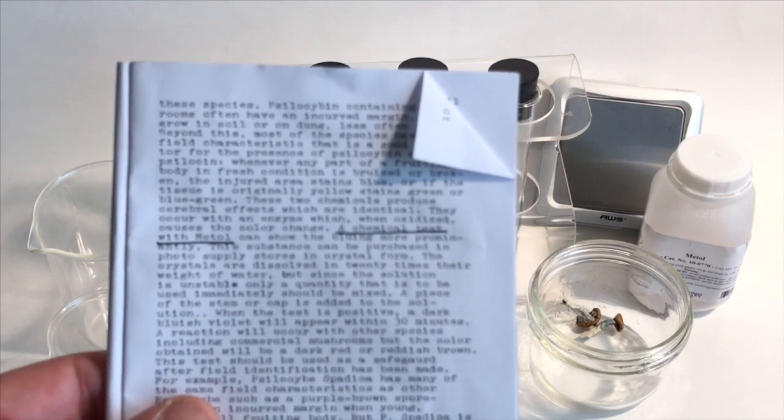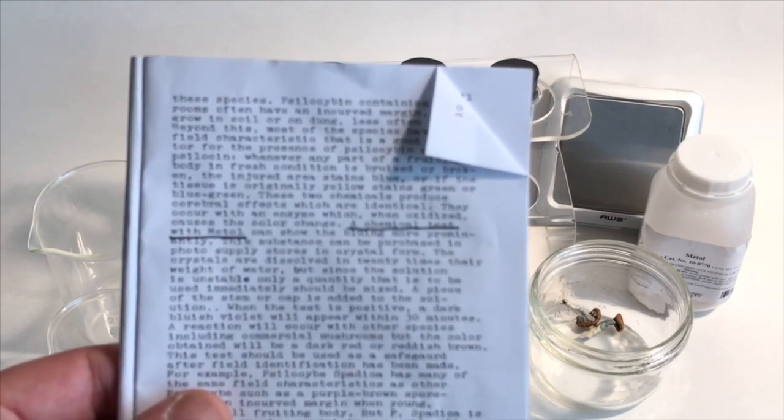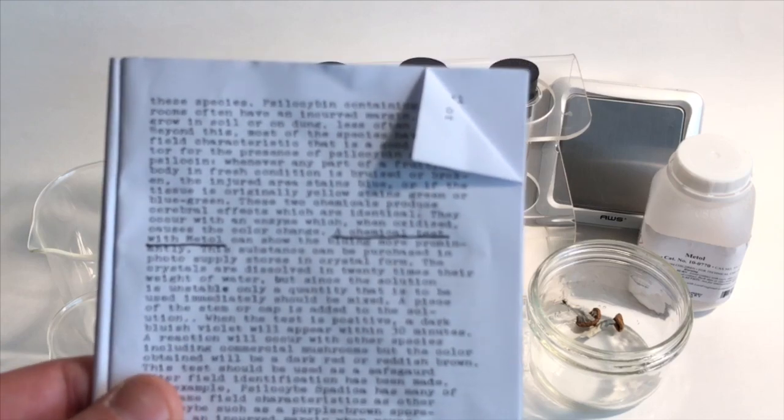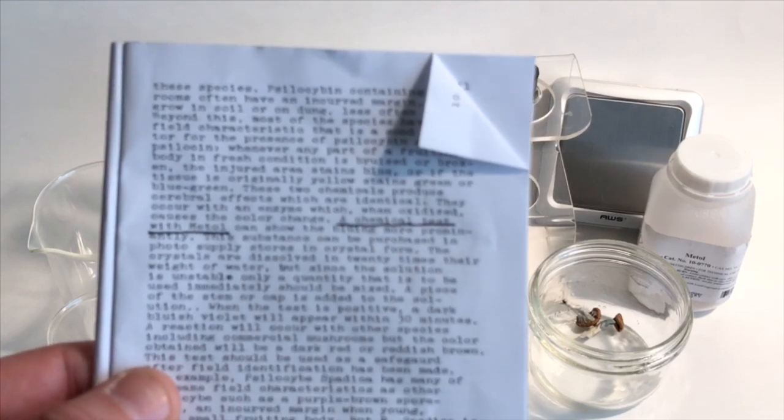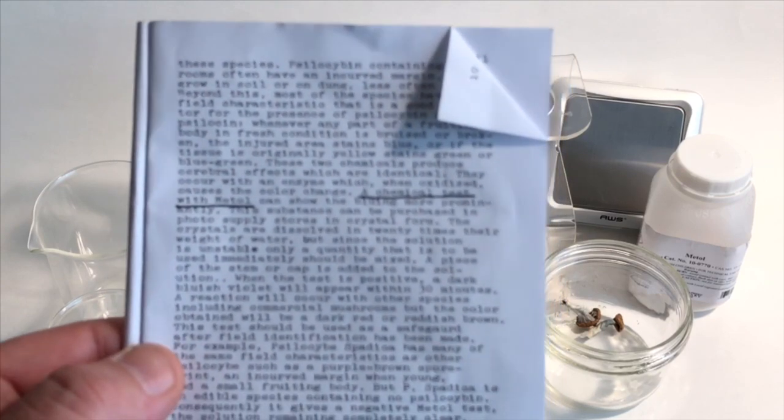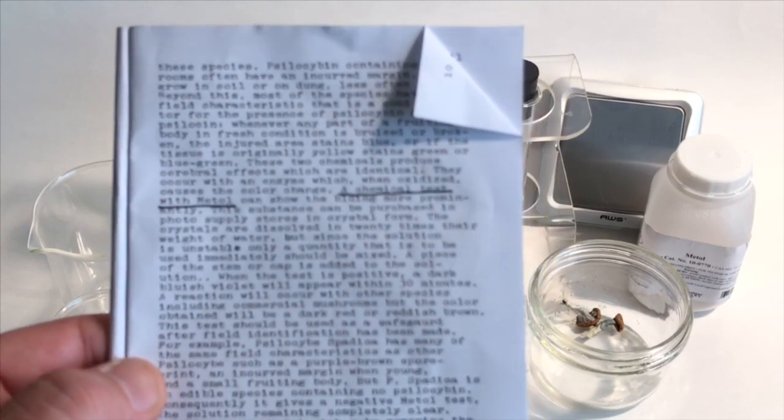When the test is positive, a dark bluish violet will appear within 30 minutes. A reaction will occur with other species including commercial mushrooms, but the color obtained will be a dark red or reddish brown. This test should be used as a safeguard after field identification has been made.